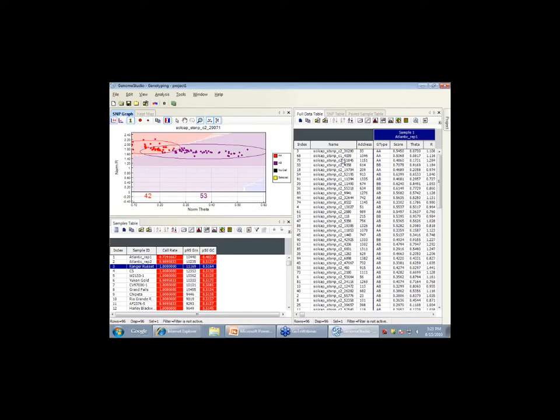Of the final array, the SNPs were chosen to basically represent as many scaffolds as possible, based on the genome sequence that Robin talked about. They were also chosen on candidate genes that people were interested in around the carbohydrate pathway and some others. So that's the general selection of SNPs. And the criteria for that is on the SolCAP website, on how we selected those SNPs.